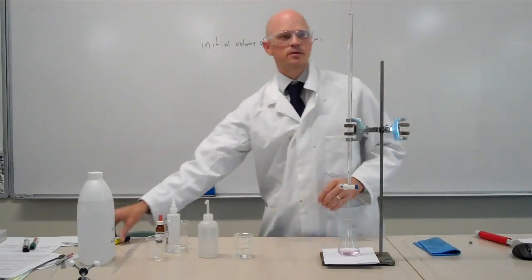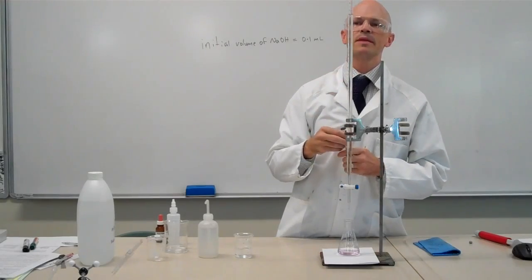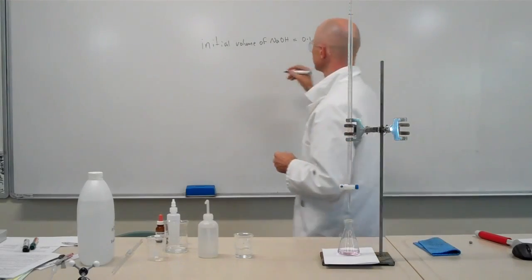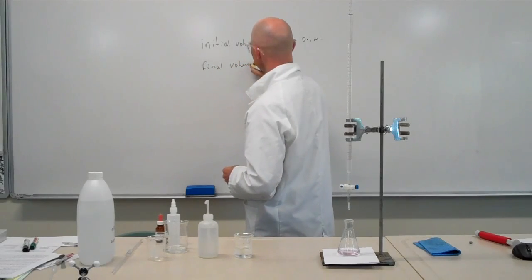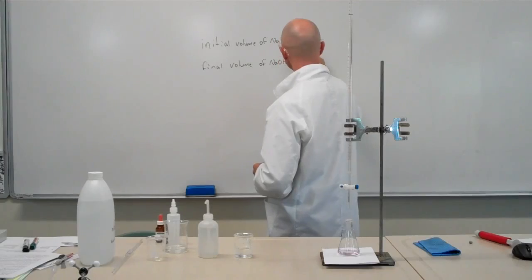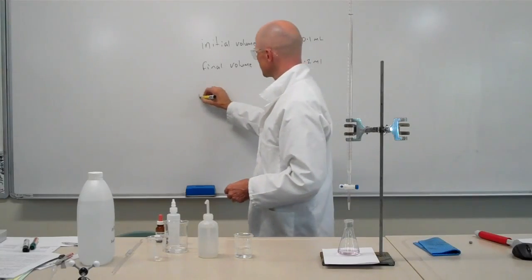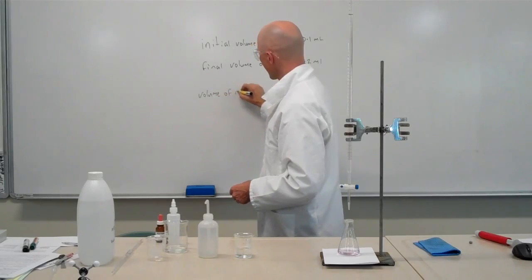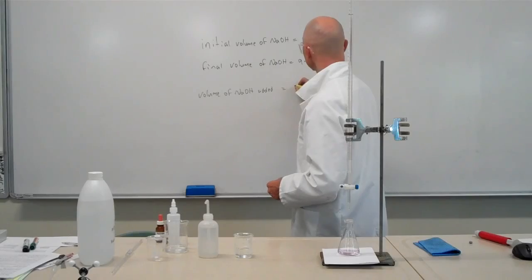I would now measure my amount of sodium hydroxide. I'm now down to 9.2 ml. So my volume of sodium hydroxide added equals 9.1 ml.